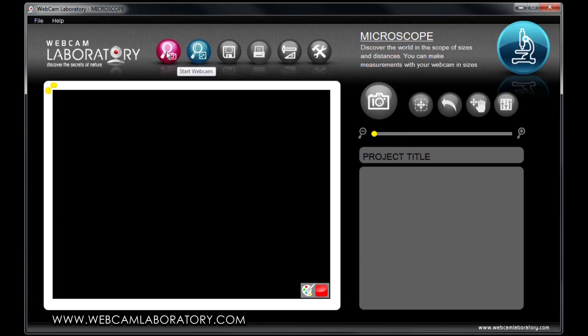At the beginning, you have two options. On one hand, you can use the webcam to take a picture, or load any picture you have.